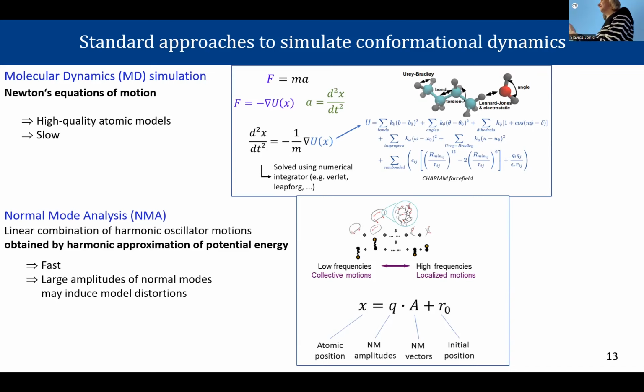But normal mode analysis cannot give you the answer on the amplitudes. You don't know how much the atoms will move. Later in our project we use data to get this information on the Q. But this A is computed based on the shape of the structure.